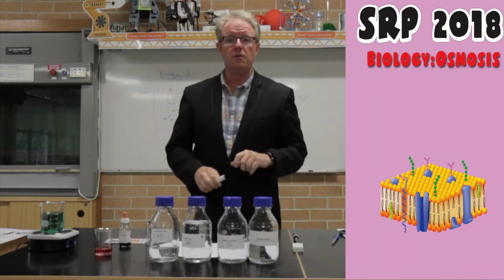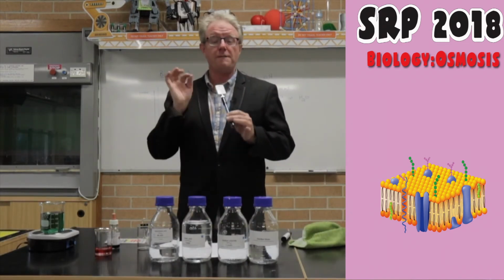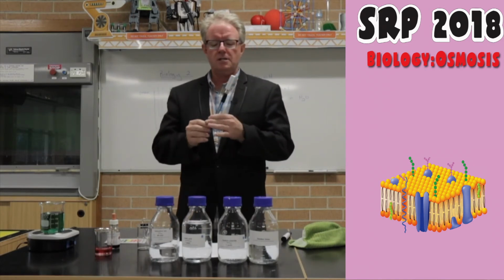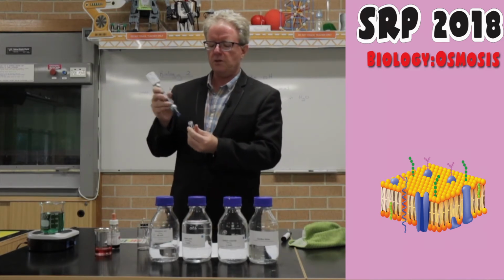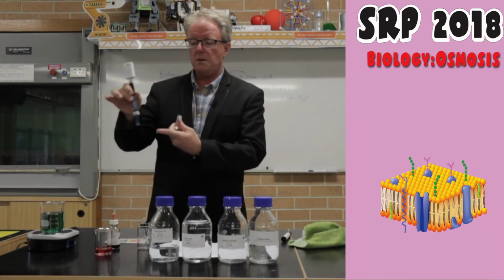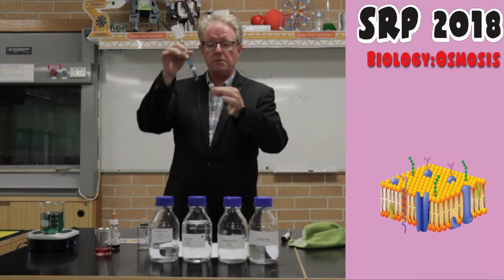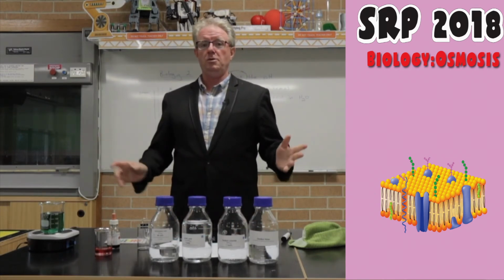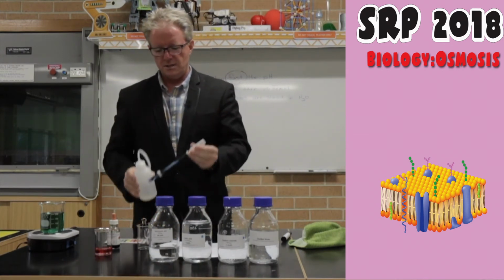But I need to tell you one more thing that's very, very important. Okay, now this is, as I just said, very important. We want to make sure about lack of contamination. So when we use solutions here, we've got to be very careful that we don't just dip it into our beaker here, and then we've got to remember that there is now solution on there. So what we need to do is we need to rinse that with distilled water before we put it in there. So you should have a bottle of distilled water with you, something like that, and you give it a rinse.